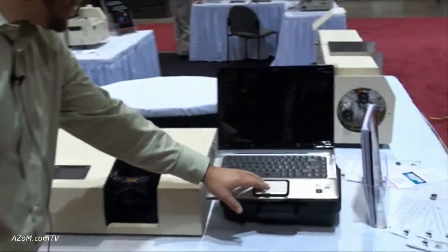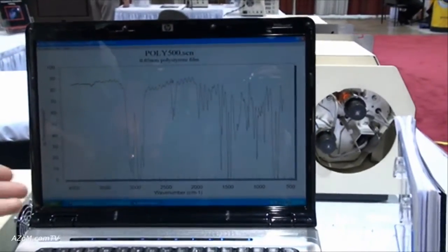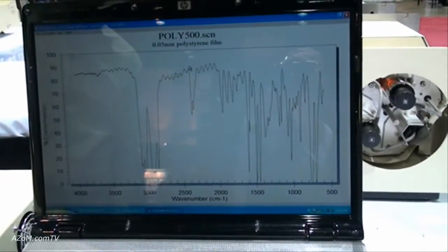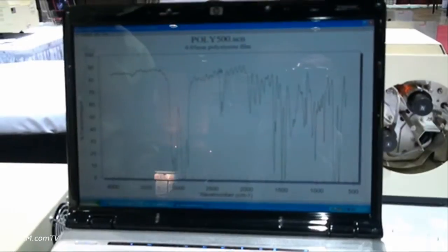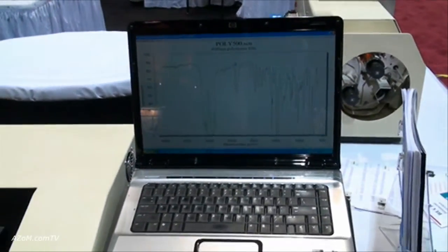It interfaces with our free EZ-Scan software. Here I'm showing a polystyrene scan. Our instrument goes from 4,000 to 600 wavenumbers, which is very useful in the mid-infrared.